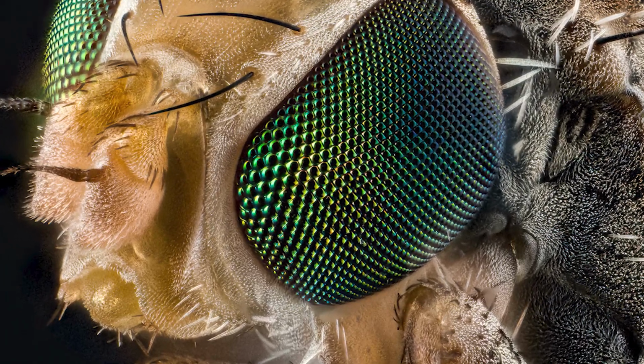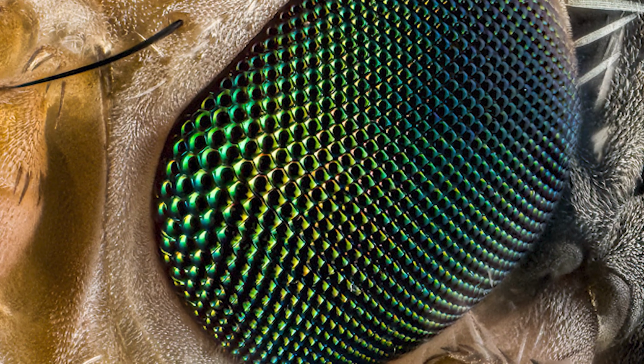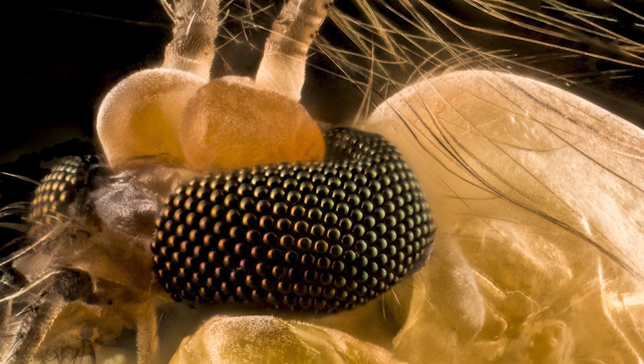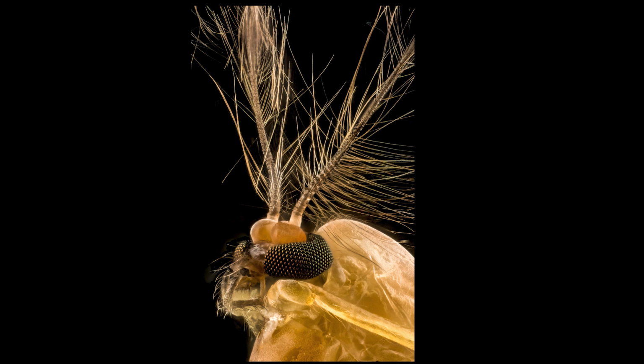I photographed two very difficult subjects. One of them was a minute little fly that I could only really see under the microscope. And this is the image, and the detail is jaw-dropping. The same goes for this not very good photograph of a mosquito. If you've ever seen a mosquito up close, you know that their antennae are just a mass of tiny, fine hairs. And they are just about impossible to photograph with any kind of separation or definition. Imagine my surprise when I saw this photograph. I mean, these individual hairs are absolutely amazing.